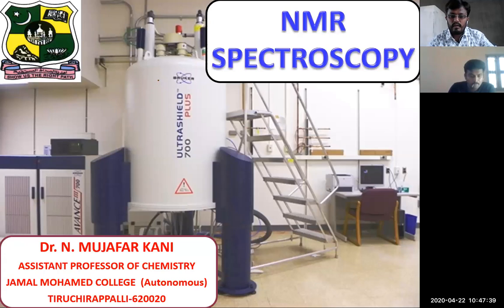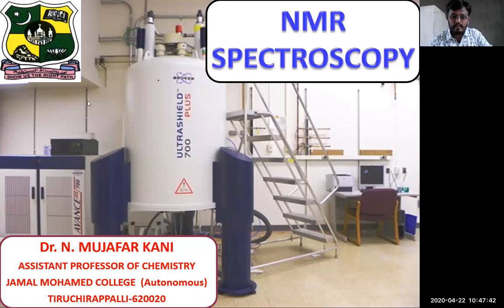Today we are going to study NMR spectroscopy. We know spectroscopy well. We have studied related parts of spectroscopy, like infrared spectroscopy, IR spectroscopy, and UV visible spectroscopy, and now nuclear magnetic resonance spectroscopy also. You know what is called spectroscopy. Spectroscopy is a branch of science which studies the interaction of electromagnetic radiation with matter, where the interaction of radiation with the chemical species is measured to obtain the characteristics, quality and quantity of the species.